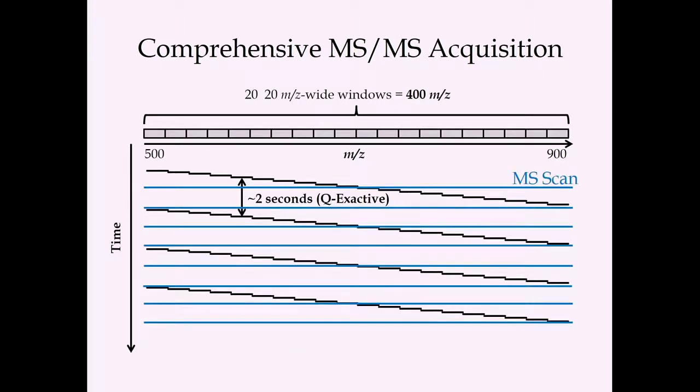And we do throw in the MS1 scan basically because we get them for free. The instrument is really fast at acquiring MS1 scans. It's a little slower to collect MS2 scans, and a lot of that comes down to just the time it takes to fill the Orbitrap. And again, we'll talk a lot more about that later.